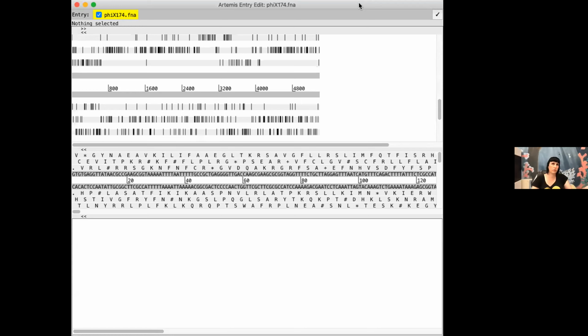And so what you do is you create, and you do new feature. Oh, no, I want to do new feature from base range. So you do create feature from base range, and it creates a gene for you. What you want to do is go back to the end, and I hit the stop codon perfectly, but the start codon I missed. As you recall, ATG is the most common. There's also TTG and GTG. And you can just drag this to probably the leftmost start codon. That's usually what phages are.